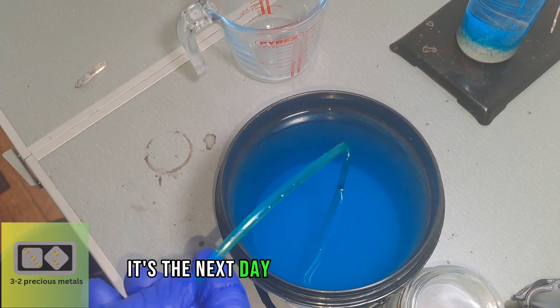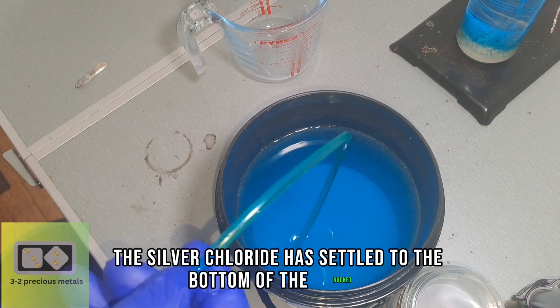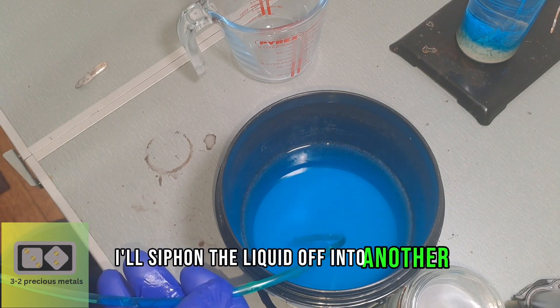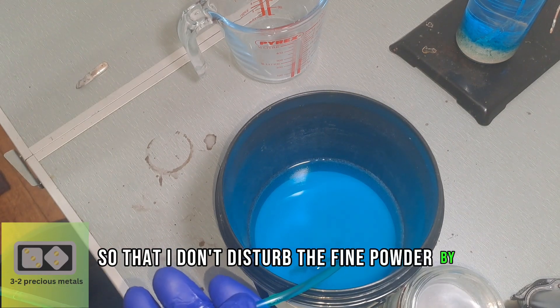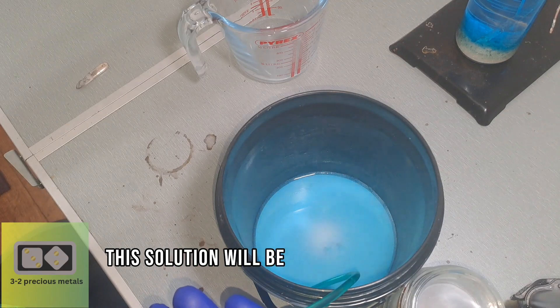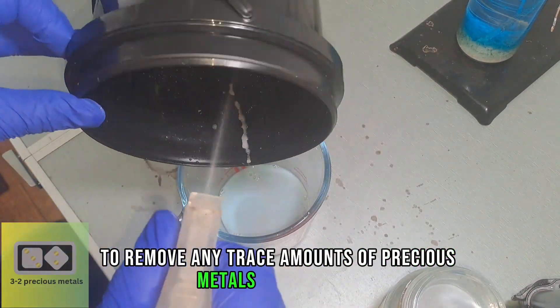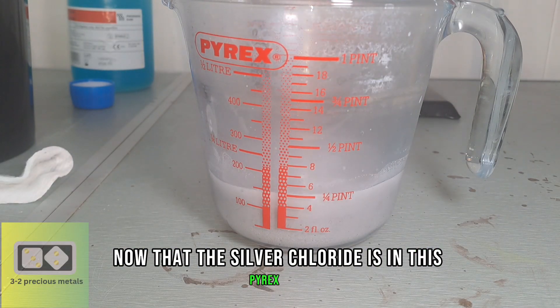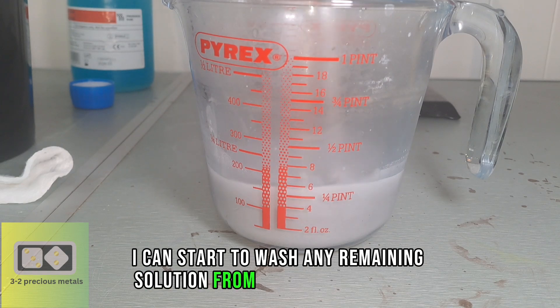It's the next day and as you can see, the silver chloride has settled to the bottom of the bucket. I'll siphon the liquid off into another bucket so that I don't disturb the fine powder by tipping it out. This solution will be added to one of my stockpots to remove any trace amounts of precious metals that remain. Now that the silver chloride is in this pyrex jug, I can start to wash any remaining solution from the silver chloride.